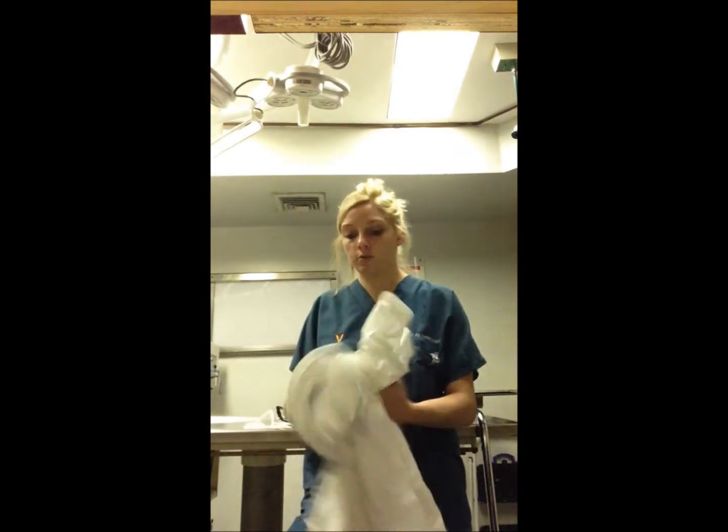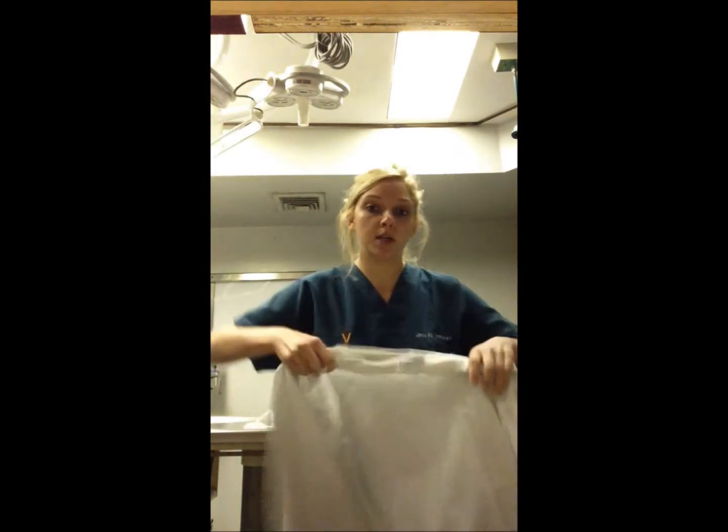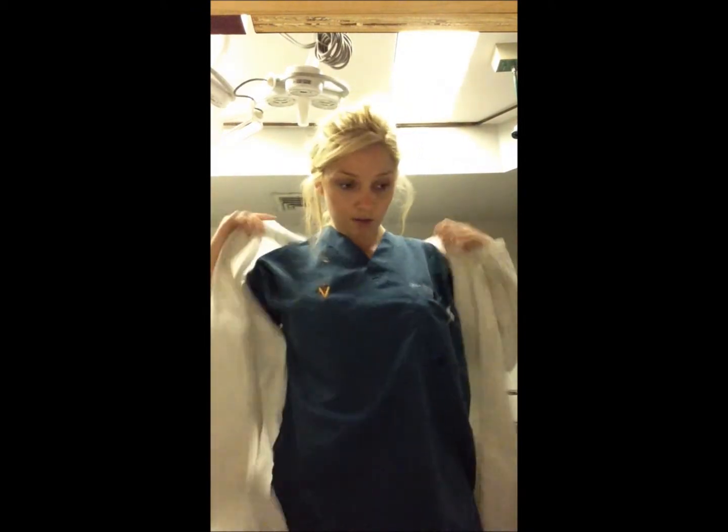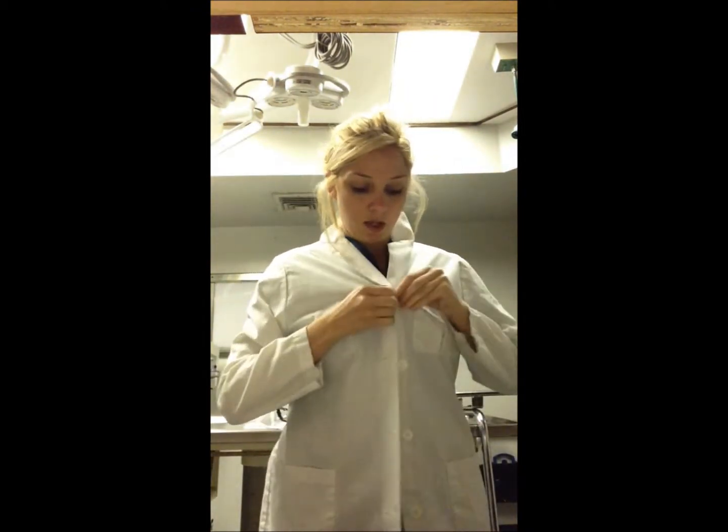If you're doing a necropsy, you want to make sure that you're properly protected. So your hands, your eyes, your mouth, you want to always wear a gown. Some clinics have disposable ones, unfortunately we do not. So you want to make sure that you cover your scrubs and button up.